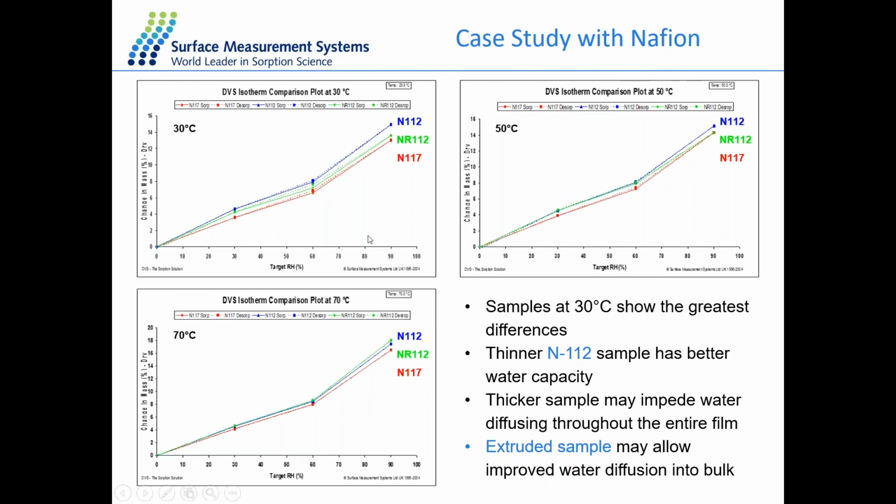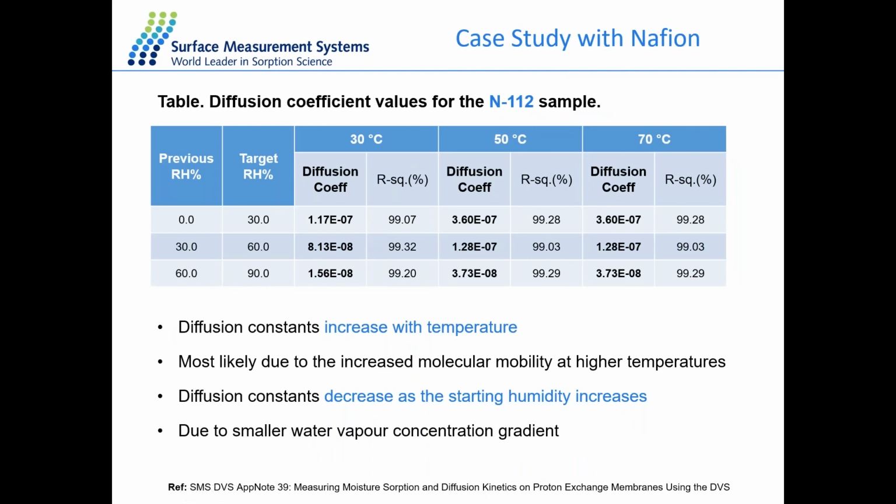And then we also calculated the diffusion constant for the N112 sample at different temperatures. So within the same line, for a different temperature, the higher the temperature, the larger the diffusion constant, which is also due to the increased molecular mobility within the sample at higher temperature.